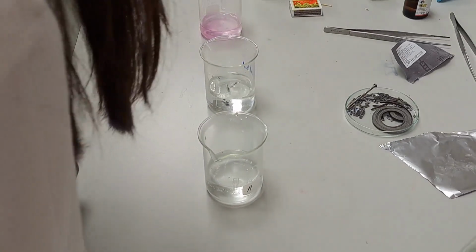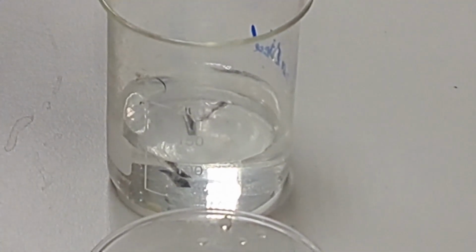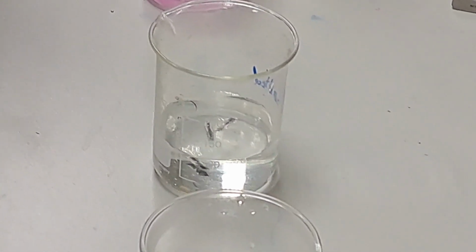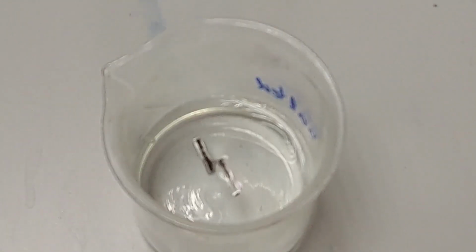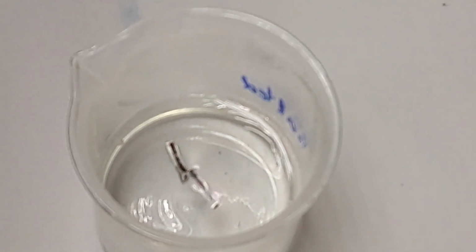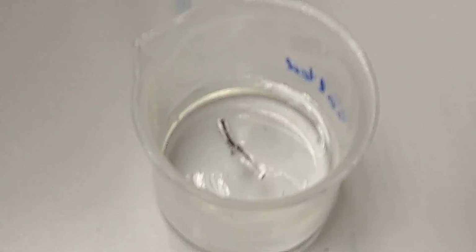Can one person come at a time? Look at the surroundings of the magnesium strip. What do you see? This is the magnesium. What does it look like around the magnesium piece? Can you see it? Wait, don't shake it. Can you see it? No. Oh, it's pink? Yes. It's a little bit pink.